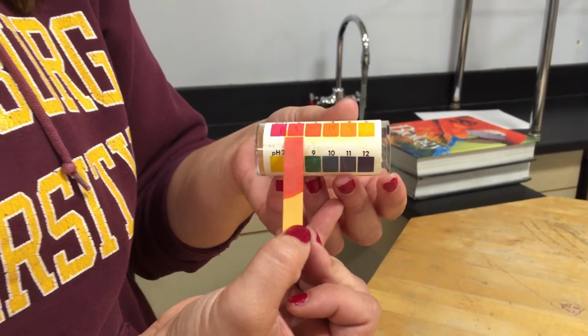Okay, so that's how you use pH strips. These go in the trash can. They do not go in the holes of the lab table, on the lab table, in your friend's hair, or any other place but the trash can.